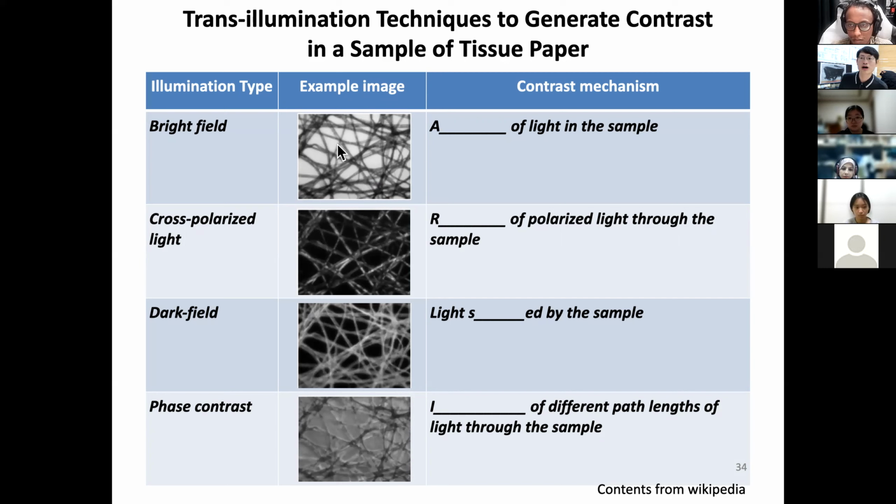Let me ask Brahanu, what's the contrast mechanism of bright field? Light illumination. Okay, great. Yes, absorption. Sadaf, what's the contrast mechanism of dark field? Reflection. Excuse me?